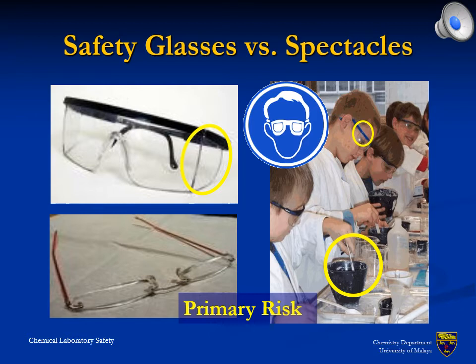The key feature of safety glasses is not, as widely assumed, the front window, but the side protection. The human eye is naturally protected by the eyelid, which closes automatically upon anything approaching. However, this protection scheme only applies for the front view, where the attention of the eye is directed to. A spill from the side will not be recognized and can, hence, easily enter the eye.